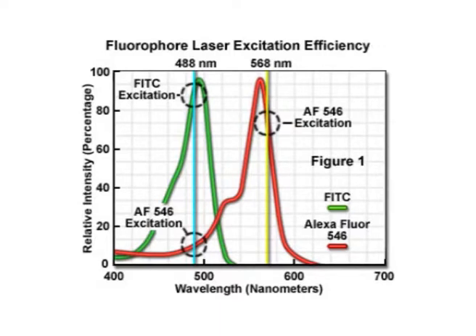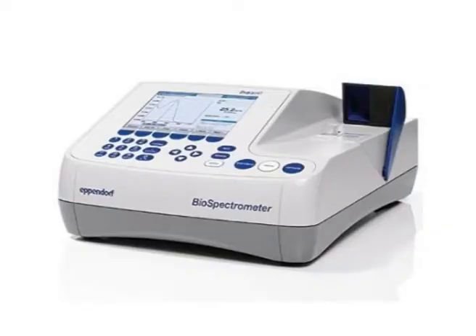The fluorescent compound shows peculiar spectra and these can be classified into 2 categories. Category number 1, absorption or excitation spectra. Number 2, emission spectra. Absorption and emission spectra are peculiar to a particular compound due to their high identifying ability. These spectra are referred to as a compound's fluorescent signature. The device which measures the fluorescence and its data is called a fluorescence spectrophotometer. It is a highly specific technique for quantitative and qualitative analysis of chemical compounds.